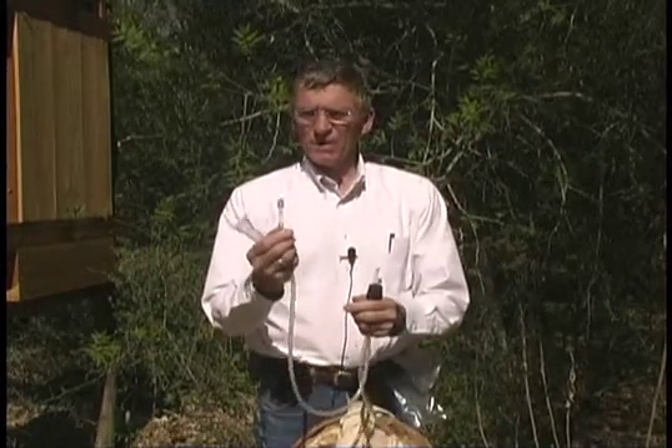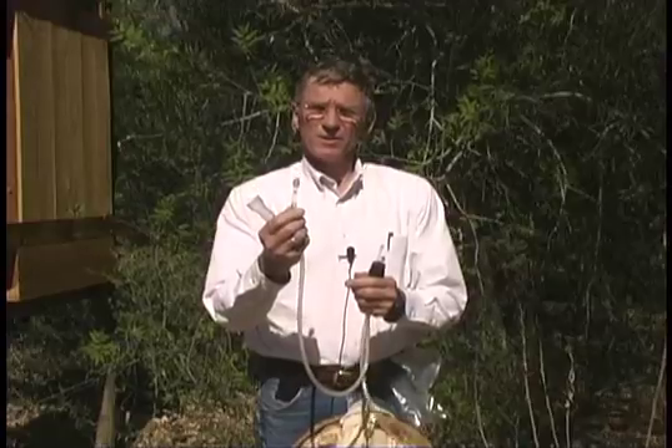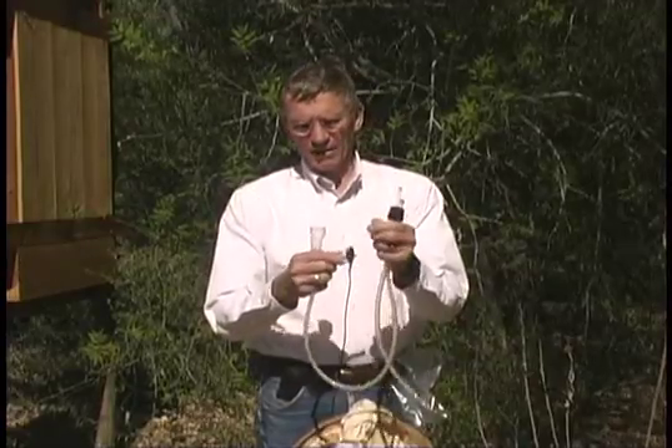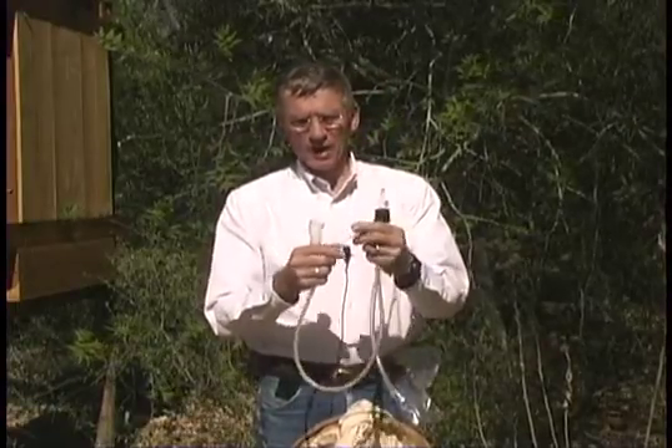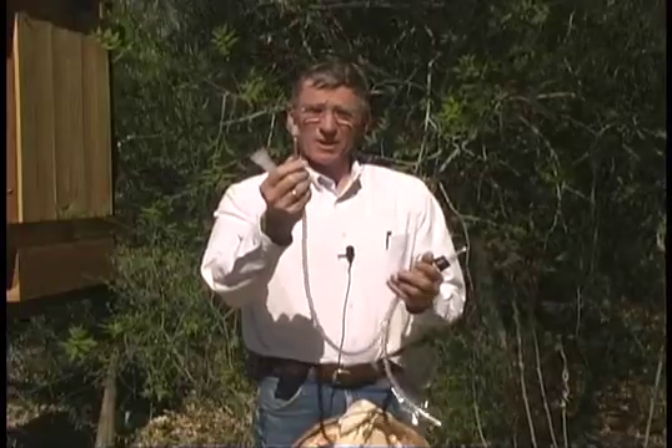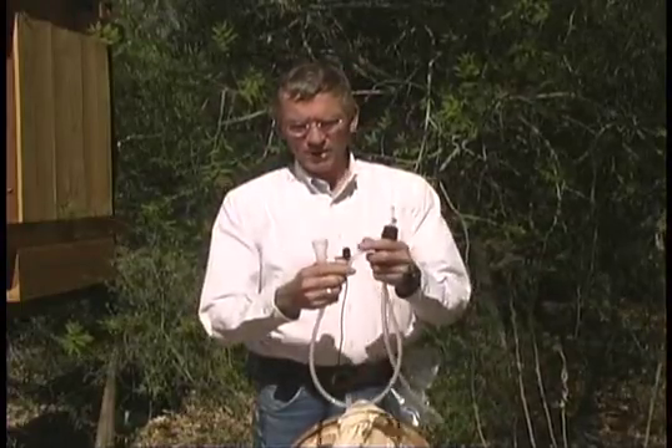This is Tygon tubing. I put a piece of glass on the end of the suction end — I find I can get closer to an insect with a glass tube than if I have just Tygon tubing. I also keep a little cap on the end so that nothing can escape once I've finished collecting.